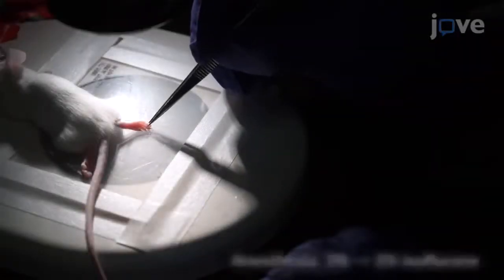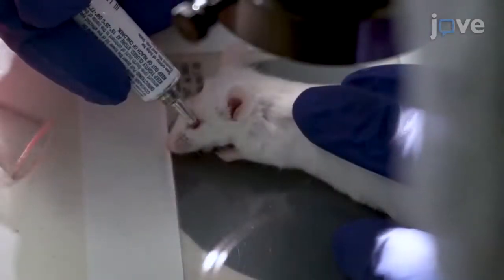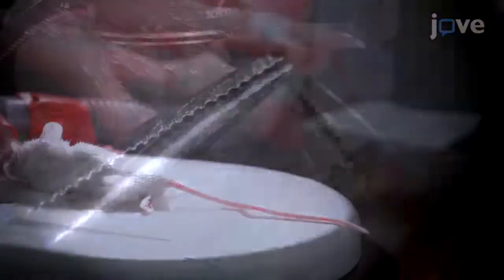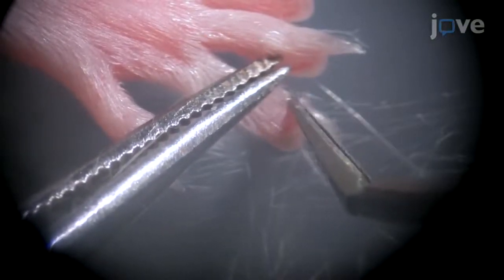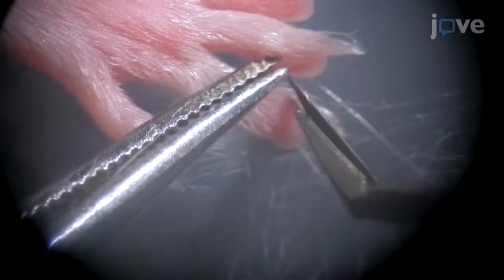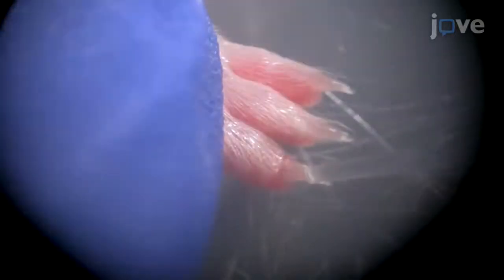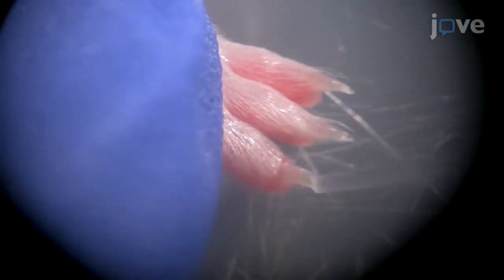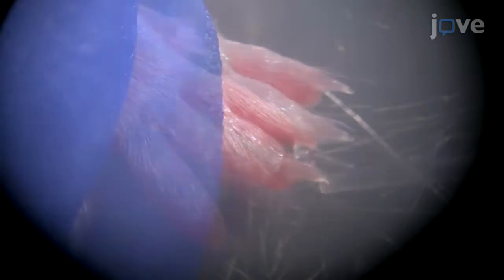After confirming a lack of response to toe pinch in an 8- to 12-week-old CD1 mouse, apply ointment to the animal's eyes and place the mouse under a 10x dissection microscope. Use surgical povidone iodine and 70% ethanol to sterilize the digits of each hind limb and use micro scissors to trim hair away from the surgical site. Apply one microliter of topical bupivacaine locally to anesthetize the surgical site and gently splay one hind paw to expose the medial digit surface.